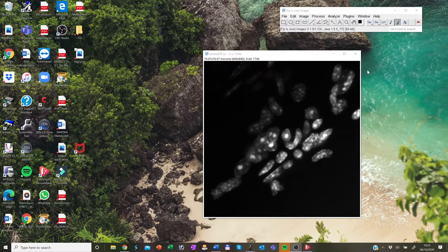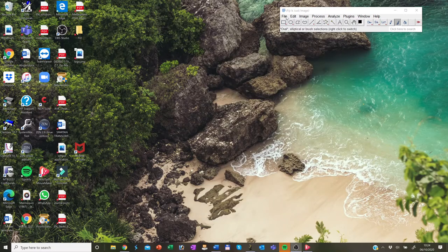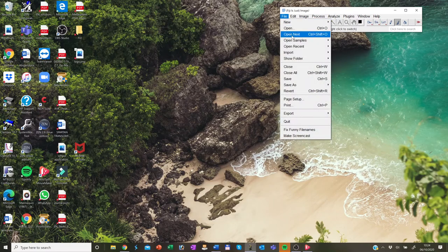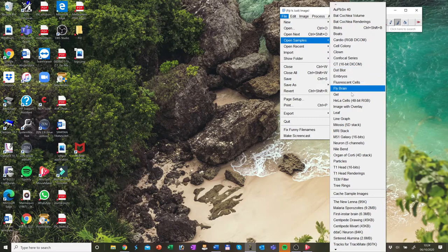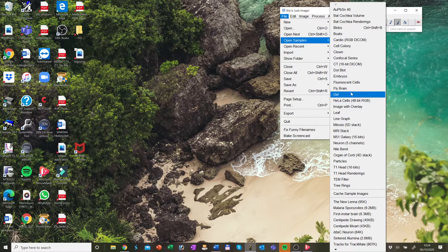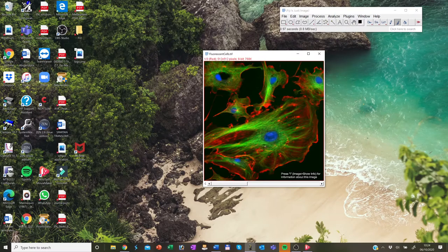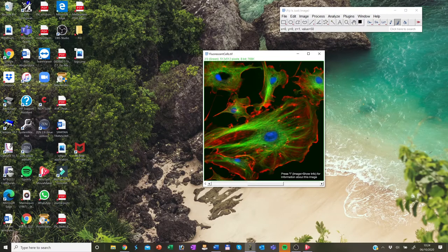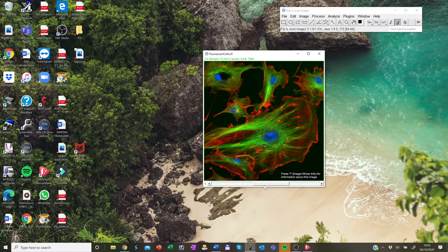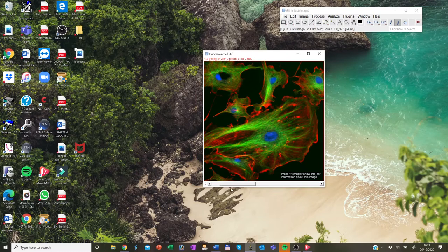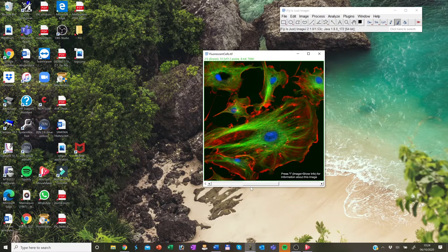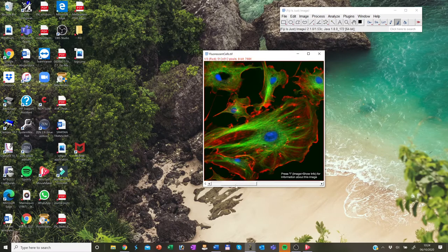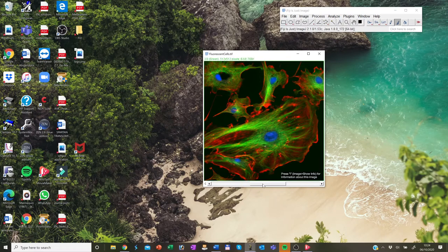Okay, so let's open up a multi-channel image. So we close that window and I go on file, open samples and open fluorescent cells. So this image will open with the channel bar along the bottom as you can see down here in this image, but this is displayed as composite mode. So even though there are three positions, one for each channel with the color displayed under the title, this image is a composite, so all channels are displayed together.